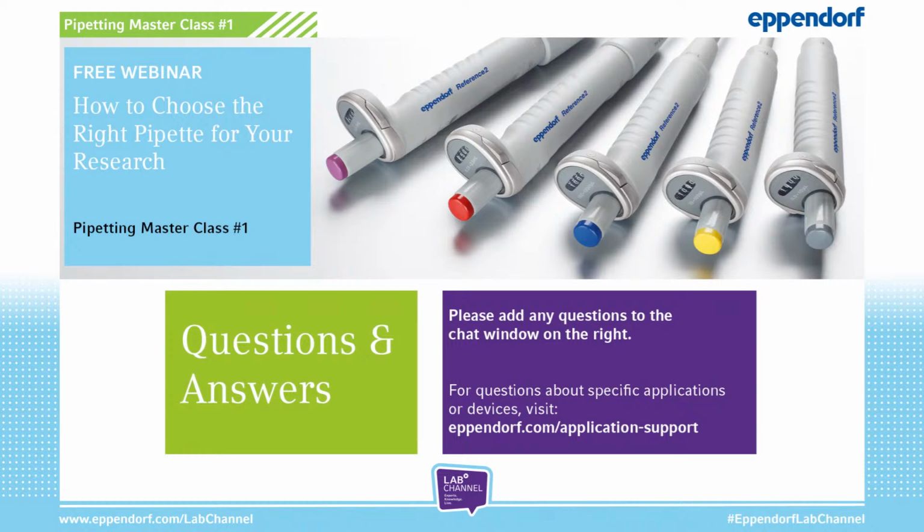Liquids, on the other hand, are also subjected to such external factors and naturally evaporate as the humidity of air is lower. A volatile liquid, like, for example, ethanol, evaporates much faster than water. During pipetting, it evaporates into the air cushion, forcing it to expand. Thus, the liquid is pressed out of the pipette tip, and then the pipette tip starts to drip.